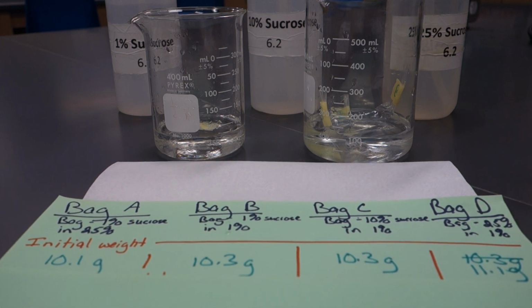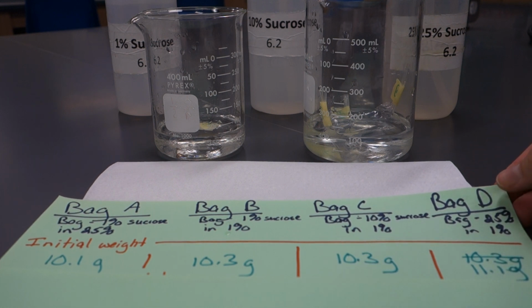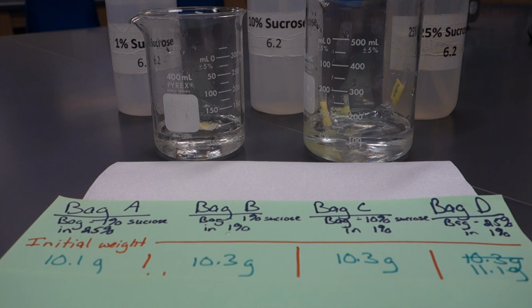And they all started at about 10 grams, give or take, because the 10 milliliters of solution inside the bag is about 10 grams. Then you add in the bag and the tape and whatever else is in here, and you see a pretty equal-ish weight. Bag D was a little bit higher than the others, even though I screwed up writing it down. I'm not fixing it. So let's look at what happened to this over time.